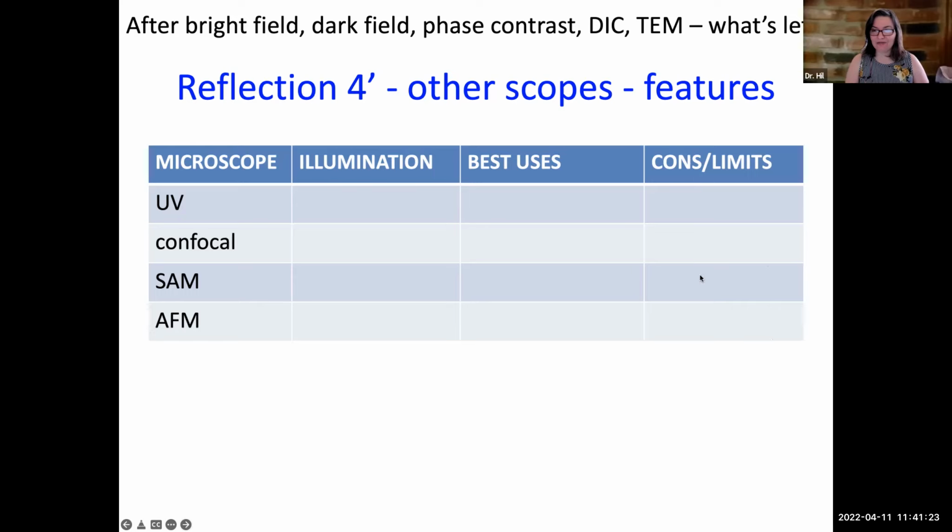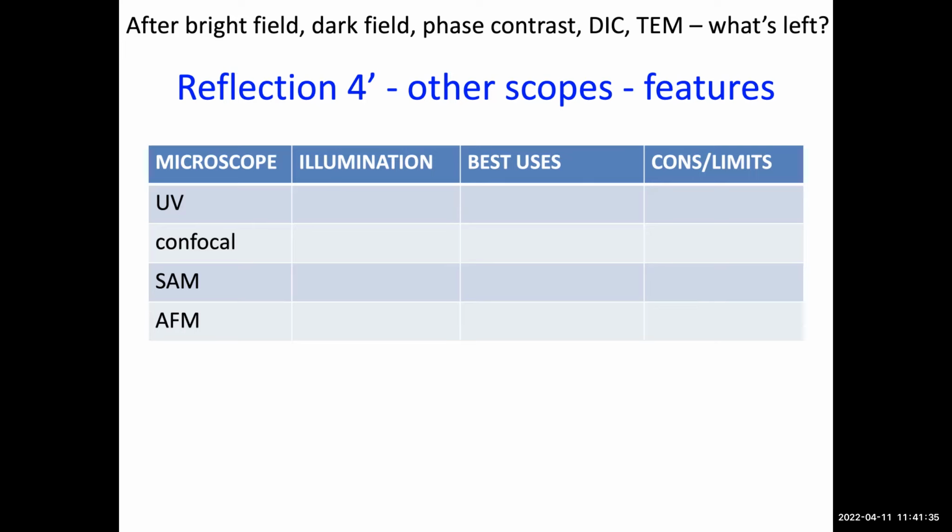Go ahead and raise your hand if there's something about the microscope that hasn't been mentioned yet. Jordan, go ahead. That it has high contrast against dark background, and then it can observe small structures inside the cells. Yeah, the contrast is really an important part of it. And it has definitely better resolution, as has been mentioned, and it allows us to see subcellular detail.